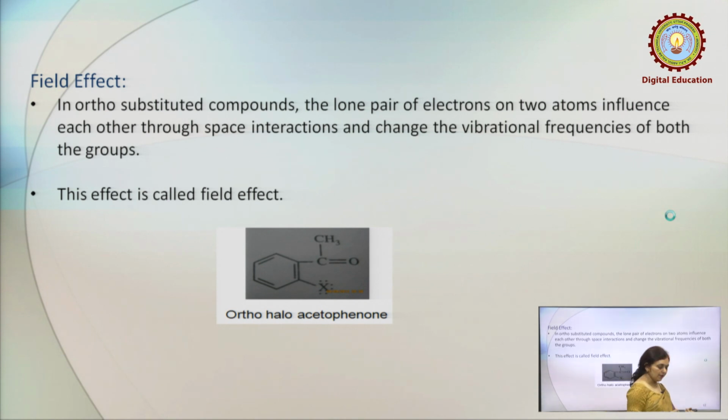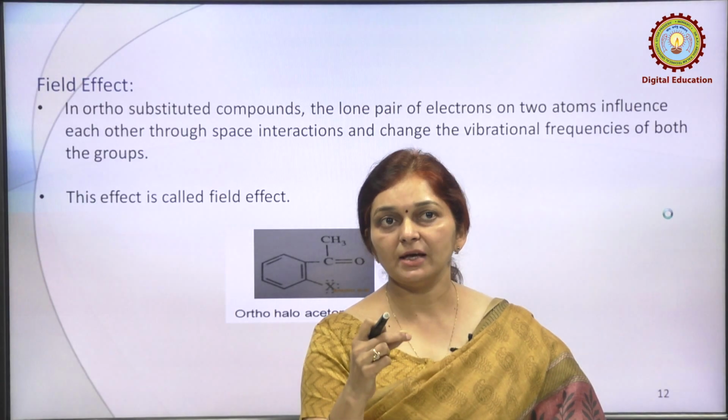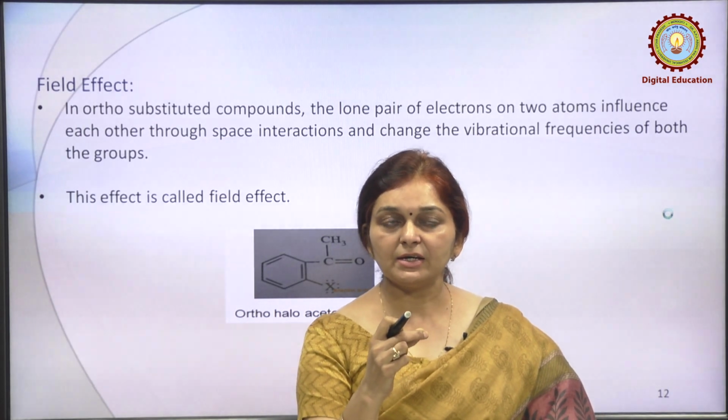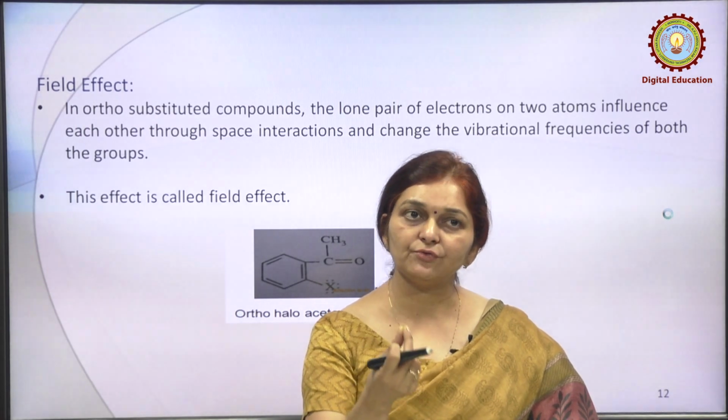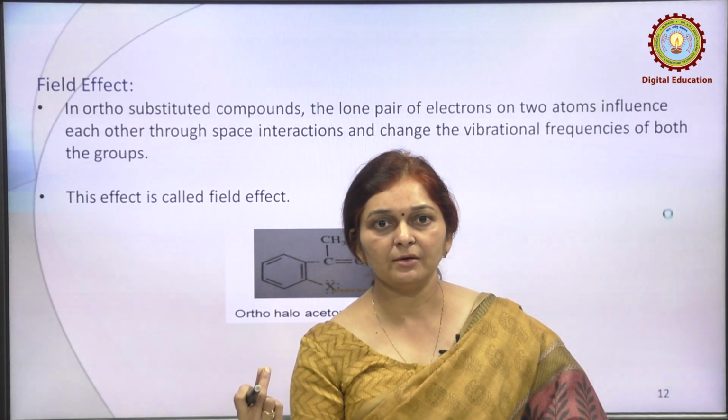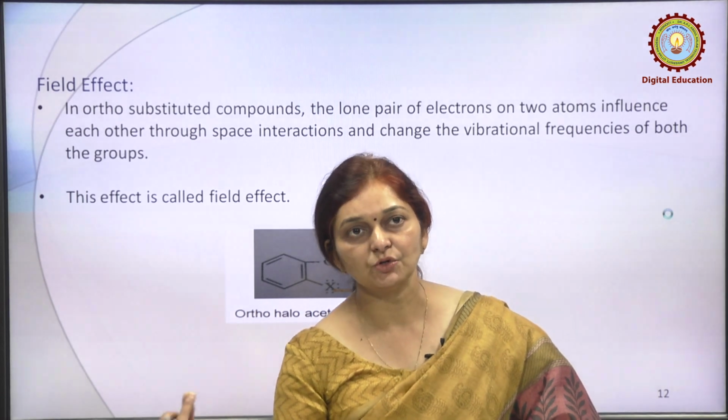Now, with the help of these vibrational frequency factors, we are able to identify the given compounds from the spectra. An IR spectrum is in the form of a graph where various peaks are observed, and with the help of these peaks we can initially identify which types of functional groups are present and which type of group is adjacent in the compound.